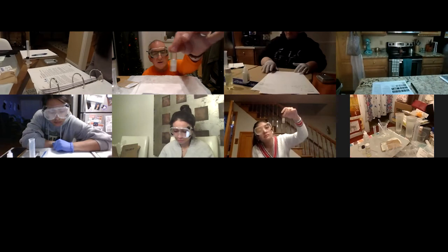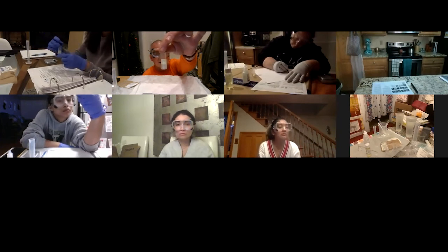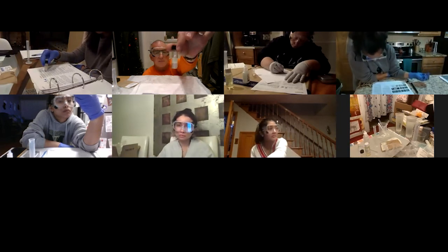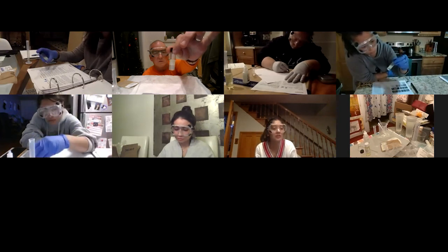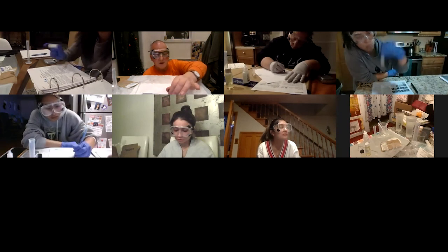But even now, you can see that the top layer, which before was clear, is now cloudy. So basically we're forming these micelles. They're pretty big right now. We want them to be as small as possible.